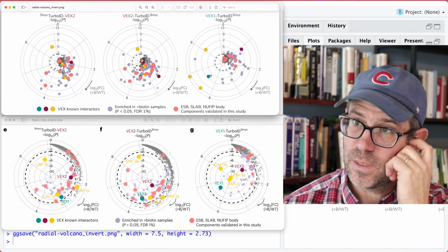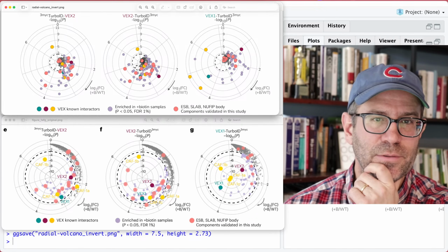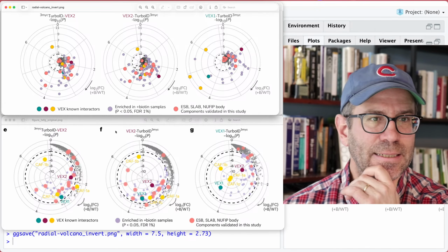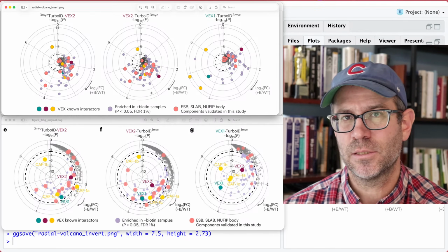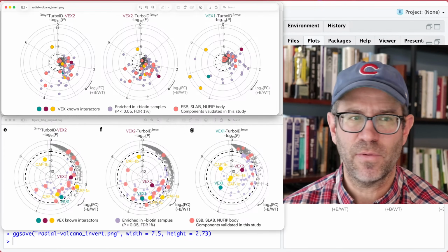Yeah, so the question of a conventional plot. So again, there's tinkering that we could do with this and kind of thinking about this. The other thing that I haven't talked about is that they're using the p-value. They're not using the adjusted p-value. And I think they should be using the adjusted p-value.